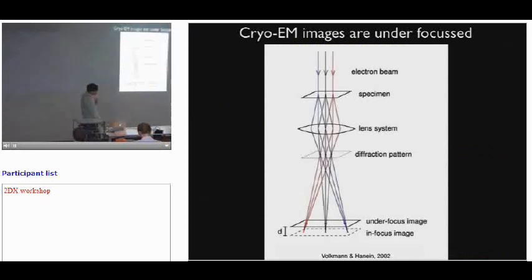So in principle, for collecting image data, we are always trying to use underfocus because of the very low frequency. We usually have an overlap, and then we have a contrast reversal for most of the low frequency, and that makes it more complicated to deal with. People just rather take it in underfocus, and that really means that the specimen is in a higher plane than our focal point. This later becomes important if you think about specimen height, and of course sometimes specimens have different heights, like in a tilted grid and so on.